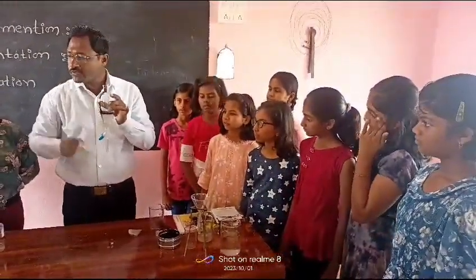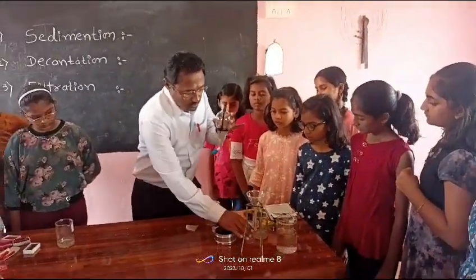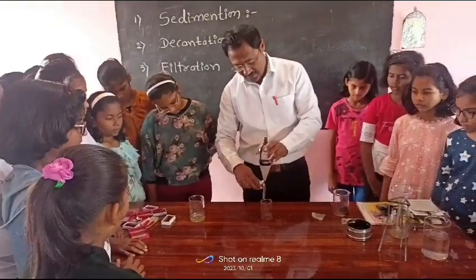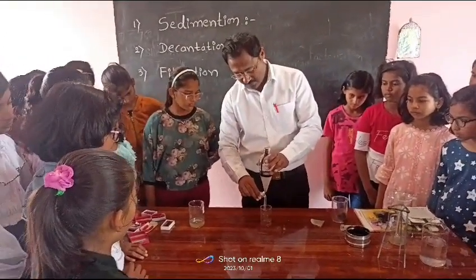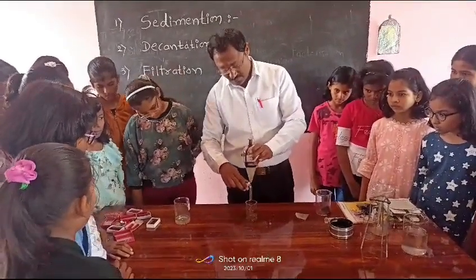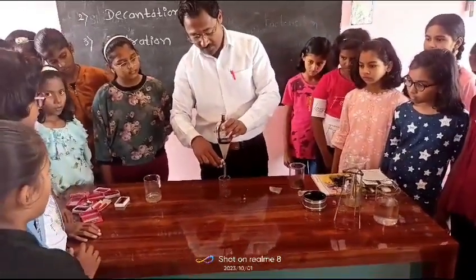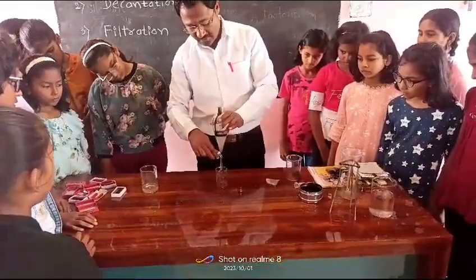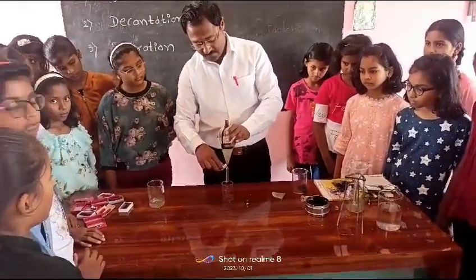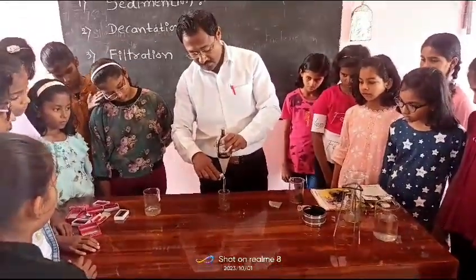Now how can we separate this mixture? By opening the cork slowly. Here I open the cork. Focus here. Now what will happen? Water is flowing down.